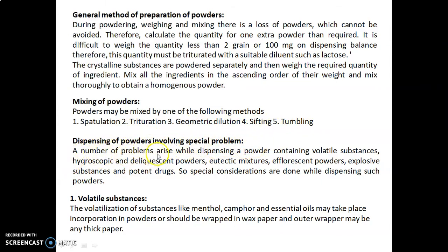A number of problems arise while dispensing a powder containing volatile substances, hygroscopic and deliquescent powders, eutectic mixtures, efflorescent powders, explosive substances and potent drugs. So special considerations are made while dispensing such powders.